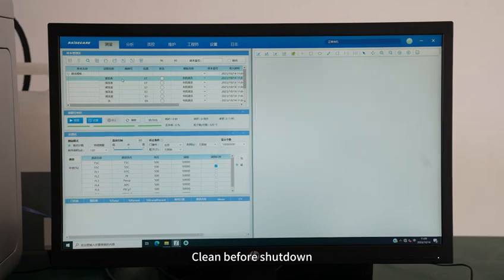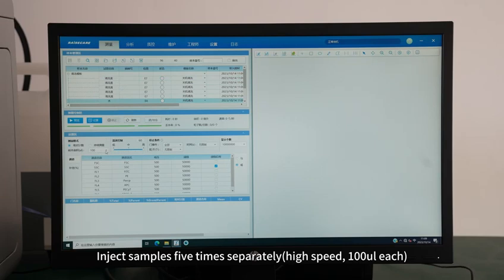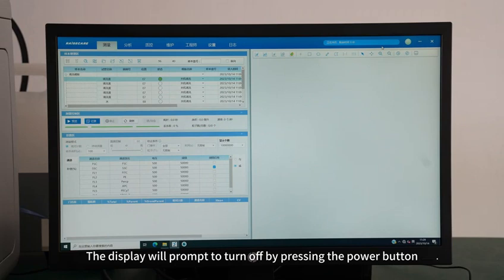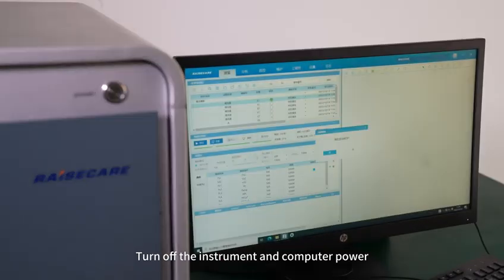Maintaining shutdown. Clean before shutdown. Place cleaning solution in position E7 and pure water in position E8. Inject the samples 5 times separately, high speed, 100 UL each. After cleaning, click the shutdown button in the upper right corner and wait for about 10 minutes. The display will prompt to turn off by pressing the power button. Turn off the instrument and computer power.